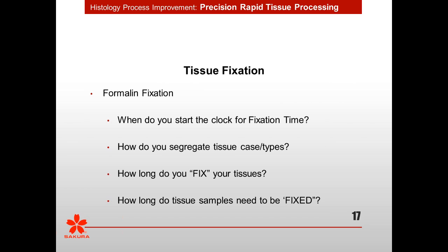When you start controlling this process, you don't need it down to seconds and minutes, but you do need to know if it was in there for an hour or 2 hours. Even more important now, as we move forward with our newer and advanced techniques, such as with the breast, you want to know how long it took from excision to getting it into fixative. And if you're looking at ASCO CAP guidelines, you're only allowed 1 hour from that time before you have an invalid sample, or at least you have to show that you are controlling that time from when it's been excised to when it goes into the fixative. And if it is longer than that 1 hour, you're supposed to be putting a note into your report.